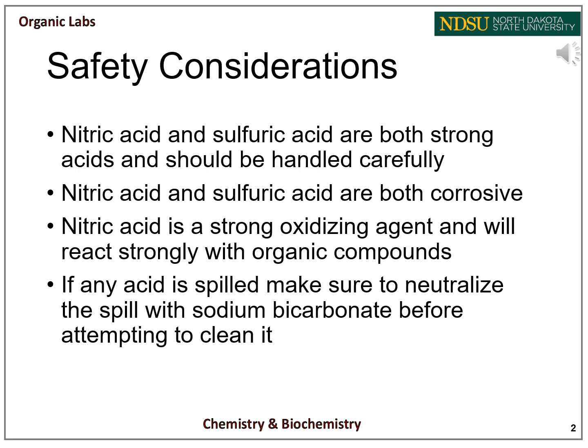Additionally, nitric acid is a strong oxidizing agent and will react very strongly with organic compounds, so make sure to wash any glassware that contained nitric acid with water before trying to clean it with other solvents. If any acid is spilled in the course of the lab, make sure to neutralize the spill with sodium bicarb before attempting to clean it.